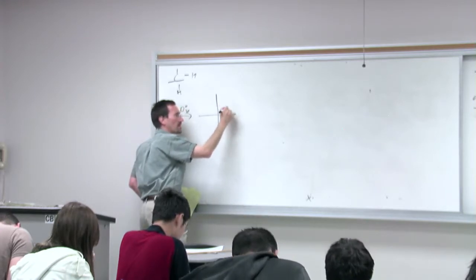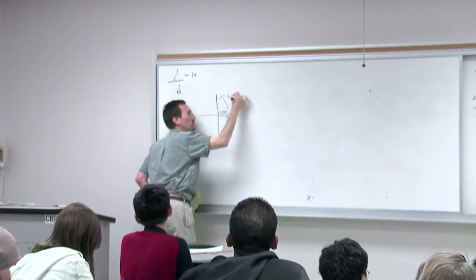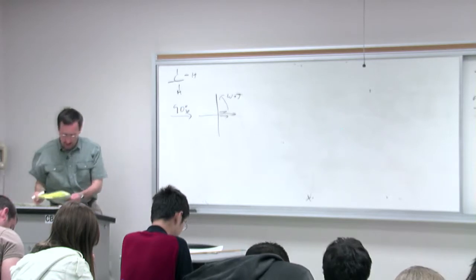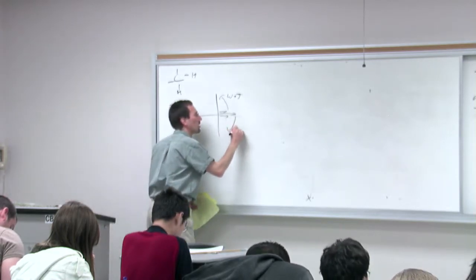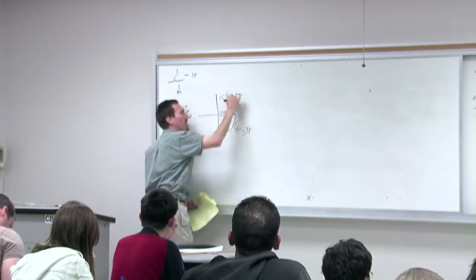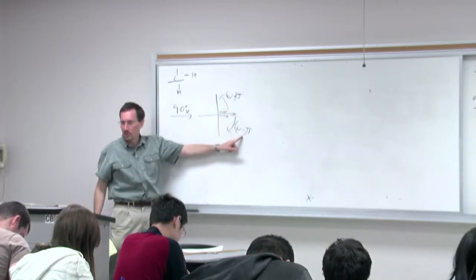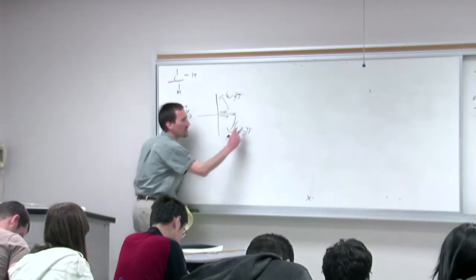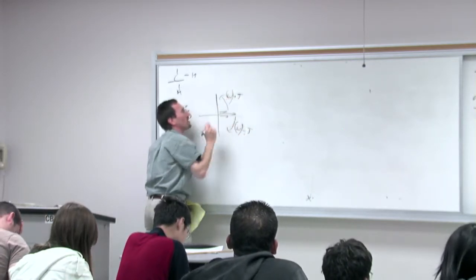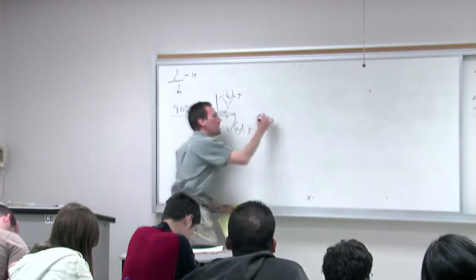One of these is going at omega. One of them is going at omega plus J. And the other of them is going at omega minus J. And of course, in the rotating frame, you just forget about the omega, right? Because the whole system's going at omega. So you've got one of them going at plus J, one of them going at minus J. I guess if I'm doing parentheses, I'll put my parentheses around the omega here. All right, so again, now we're waiting 1 over J.